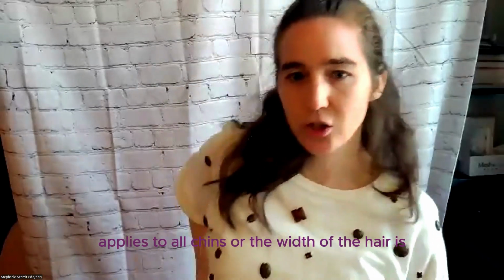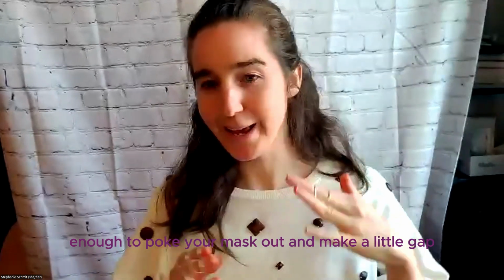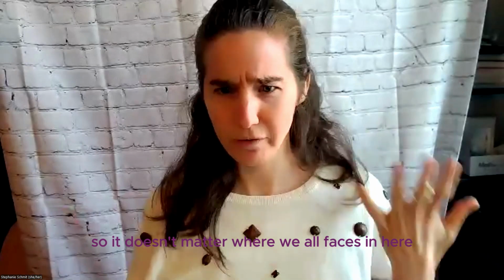Yeah, clean shaven applies to all chins. The width of a hair is enough to poke your mask out and make a little gap. So it doesn't matter. We all have faces and hair.